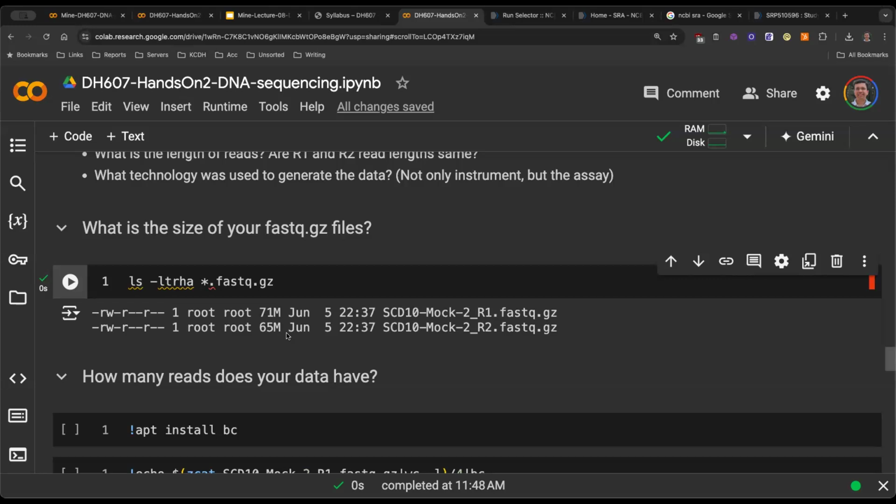So they are sequencing R1 and R2, 150 nucleotides each. I'm also telling you what the length is. Okay, and why should they then be equal? So the data will be similar, that is correct. Is there any reason that it can be different in size?